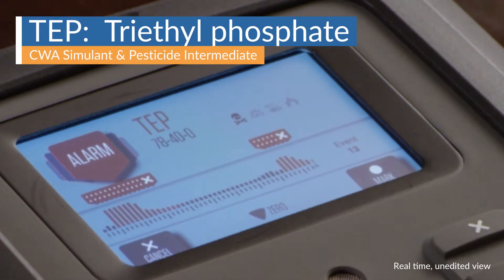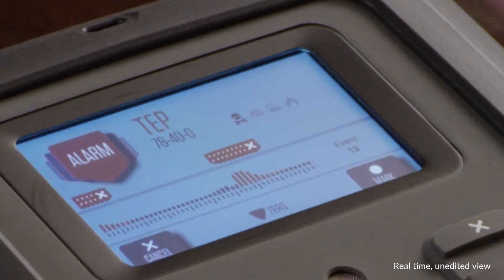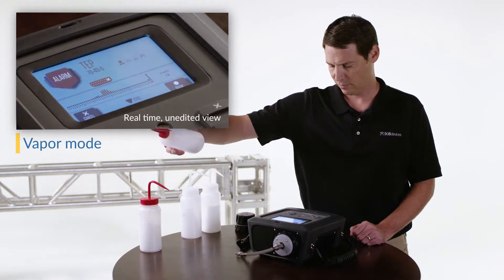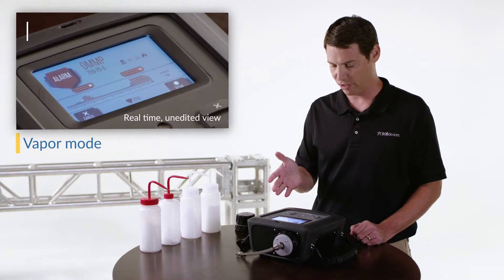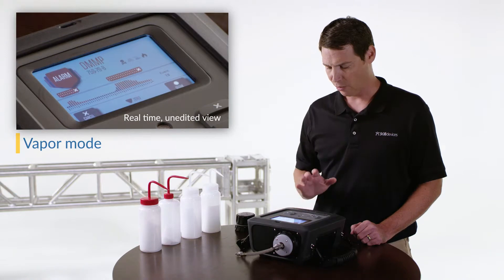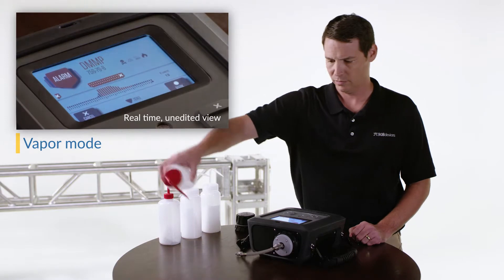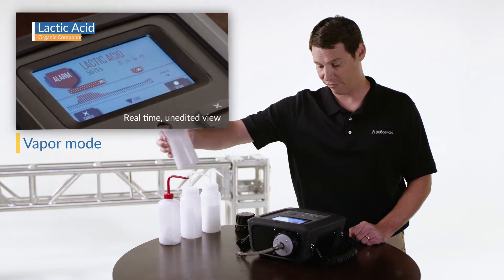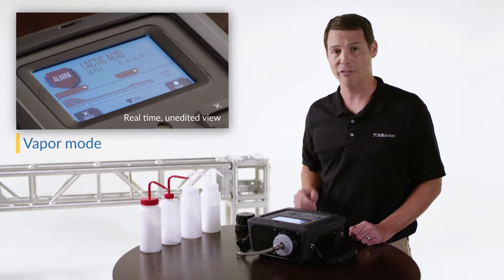This time we introduce the chemical TEP — it's clearly able to identify it with that red alarm. Again back down to a clean baseline. This time DMMP was introduced. Very strong signal, but again as clean air is being drawn through the tip of the vapor probe, the signal is dropping and we're back down to baseline. And finally lactic acid — lower signal but clearly enough to make an identification.